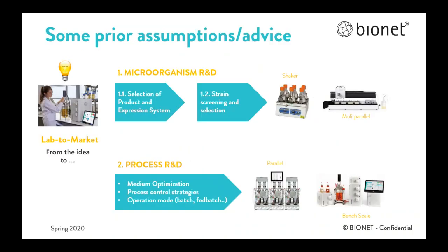The main objective of the R&D stage is to turn an idea into a product obtained through a process on a reproducible and cost-effective commercial scale. Lab scale is focused on demonstrating process feasibility or generating design data for a process. Then a mini plant may be more appropriate than a pilot plant. It includes all recycled streams and can be extrapolated easily.